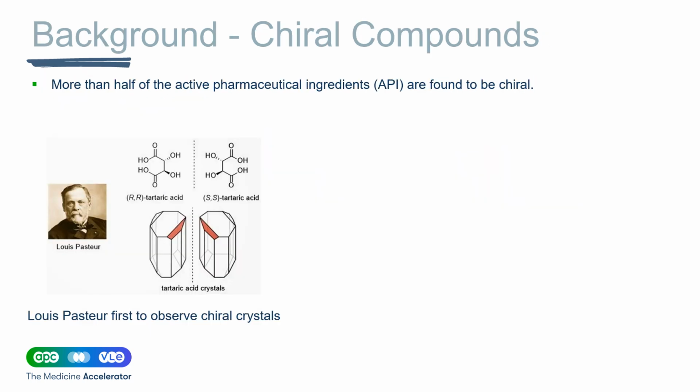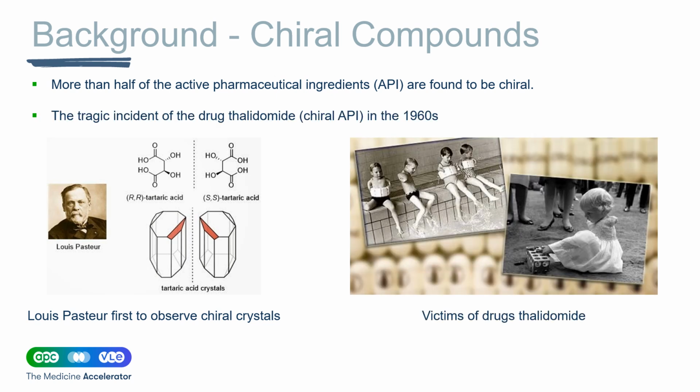Over 50% of active pharmaceutical ingredients possess a chiral center. These chiral molecules exist as enantiomers, which are non-superimposable mirror images of each other. Despite identical chemical compositions, enantiomers can exhibit distinct biological activities due to their differing three-dimensional configurations. Consequently, the production of enantiomerically pure drug substances is highly desirable to enhance therapeutic efficacy and/or mitigate potential toxicological side effects.